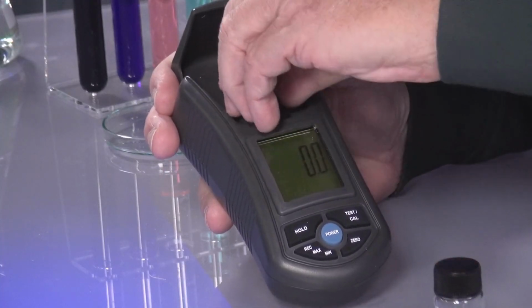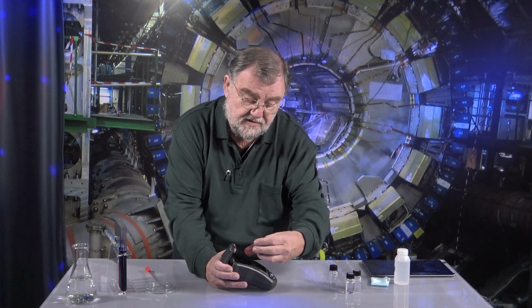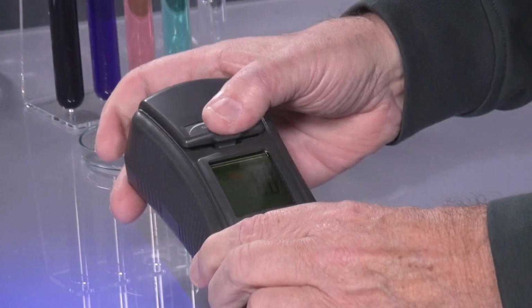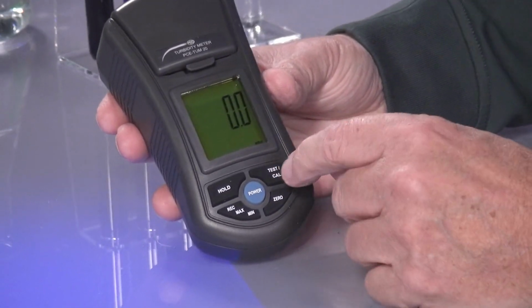The measuring area goes much further. It goes up to 1000 NTU. And when we have done that, the device is, so to say, calibrated. Then I have here from my stock what I have built up here. I have a 10 milliliter probe delivered with it, put it in and shut it. It is shut. No, it doesn't want to. And then I can test it.